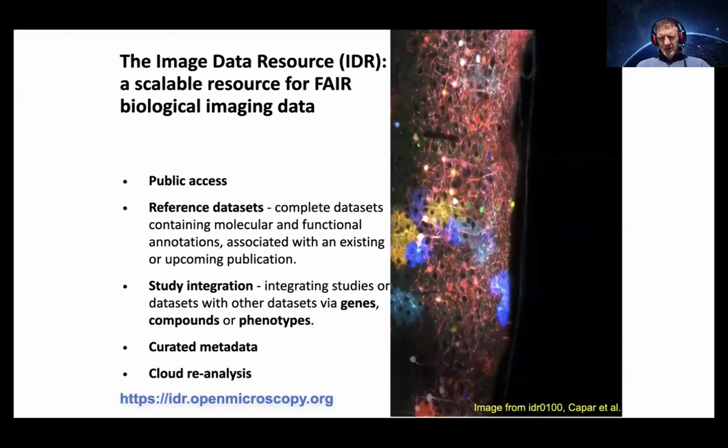It's free to deposit, and we're also very grateful to EBI for providing all the storage, because IDR is running at EBI. IDR is based on OMERO. I've seen a lot of presentations, some constraint, because IDR is read-only, you don't write to it.